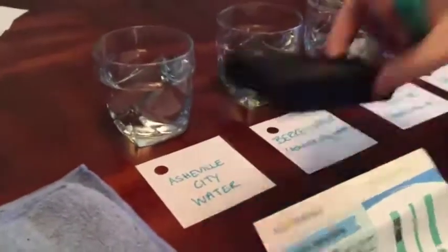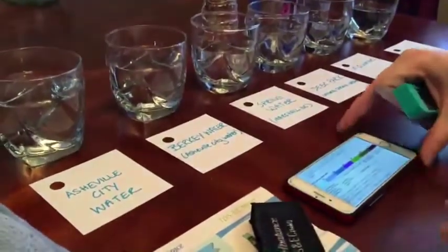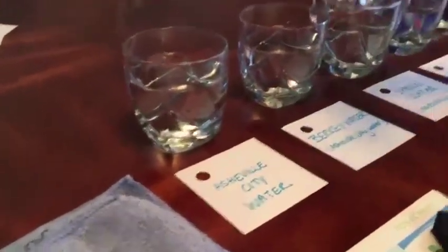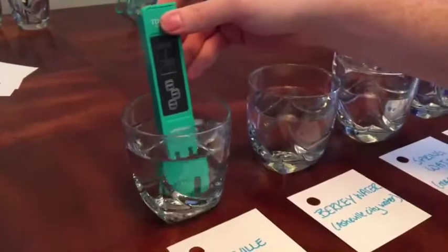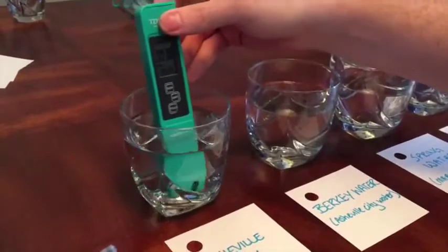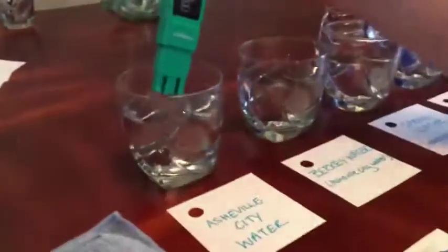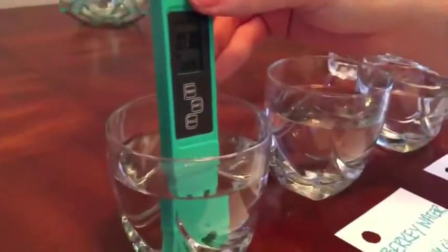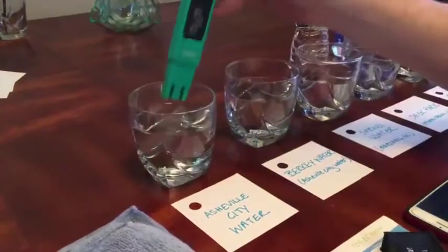I have this EPA chart from tdsmeter.com. For Asheville, North Carolina city water, the acceptable PPM rating is 0 to 50. With a slight agitation motion to ensure a consistent reading, we're seeing 30 parts per million dissolved solids. Ideally, perfectly clean water is very close to zero. Asheville water is highly chlorinated and fluoridated with extra chemicals due to significant water reuse.